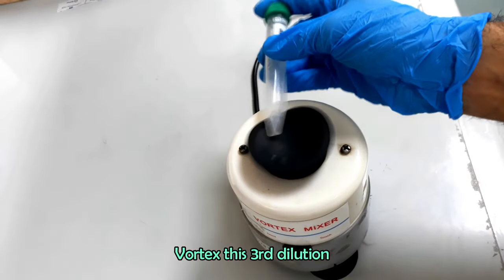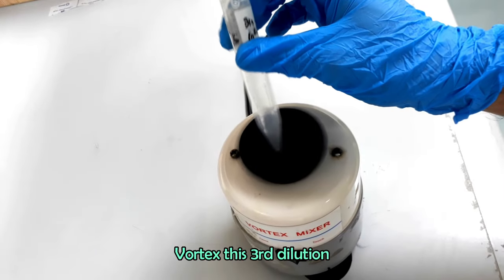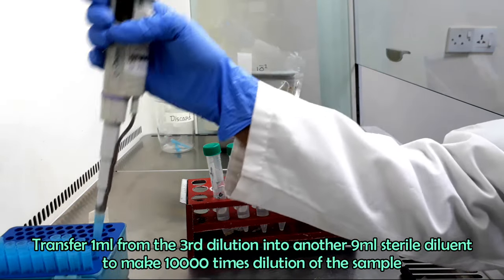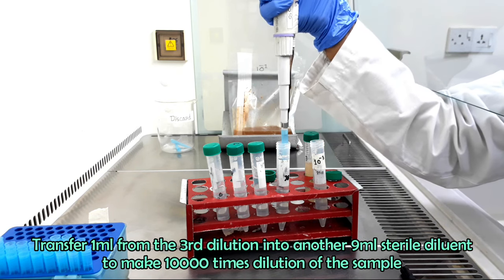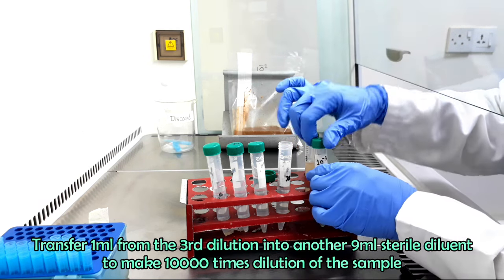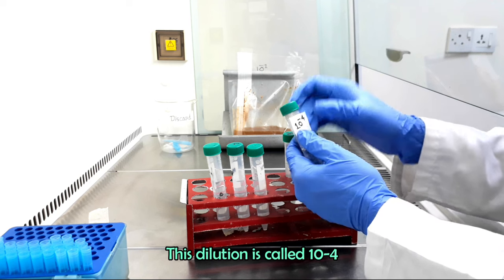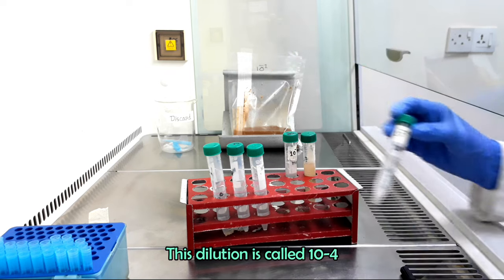Vortex this third dilution. Transfer 1 ml of the third dilution into another 9 ml sterile diluent to make 10,000 times dilution of this sample. This dilution is called 10 inverse 4.